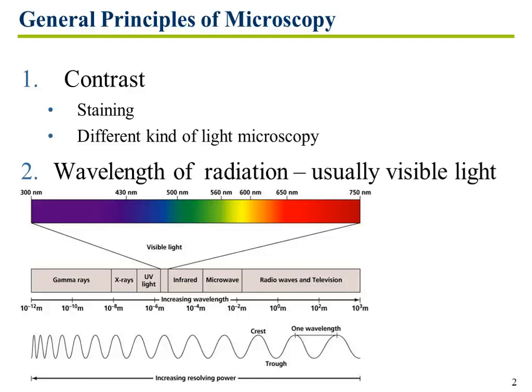You've used a 40x, high power. You may or may not have used 100x, which is the oil immersion, really high power lens. That's the one we're mainly going to be using in this course. Now, the problem in this course is going to be that we're looking at much smaller things than you've ever looked at, probably, in a microscope. And bacteria have no color.